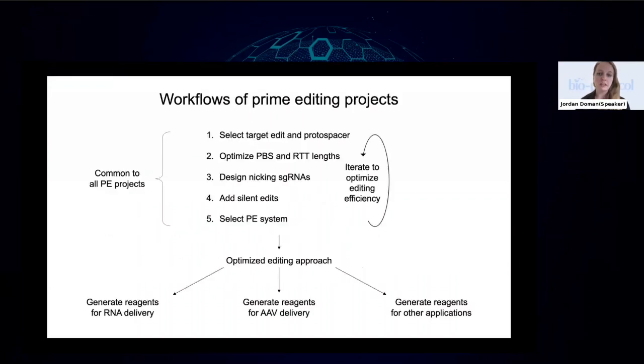Okay, so that is pretty quickly how to optimize and perform a prime editing experiment in mammalian cells. And we've gotten to this point where you've optimized your editing approach. I just want to hit on really quickly two applications from our lab that have applied an optimized prime editing approach either with RNA delivery or with AAV delivery.